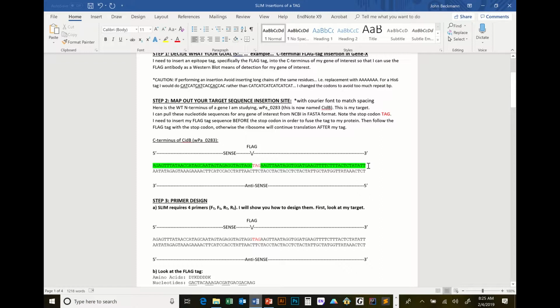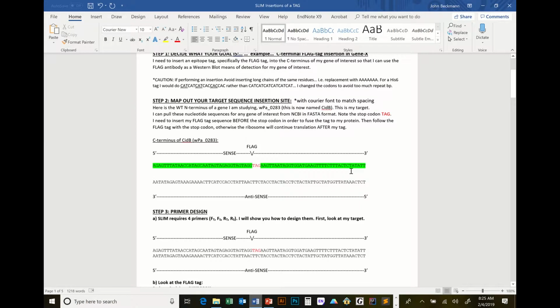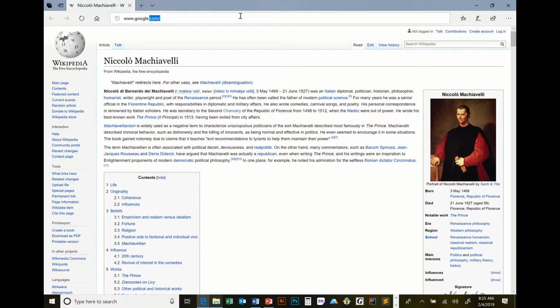So if you, that does not match. This is my error. You reverse the second line. If I reverse this. So here's what I did. Here's my problem, I didn't do the right function. Let's just do that quick. That'll be a good exercise. So here I caught an error. You've seen my logic. Let's go to reverse complement.